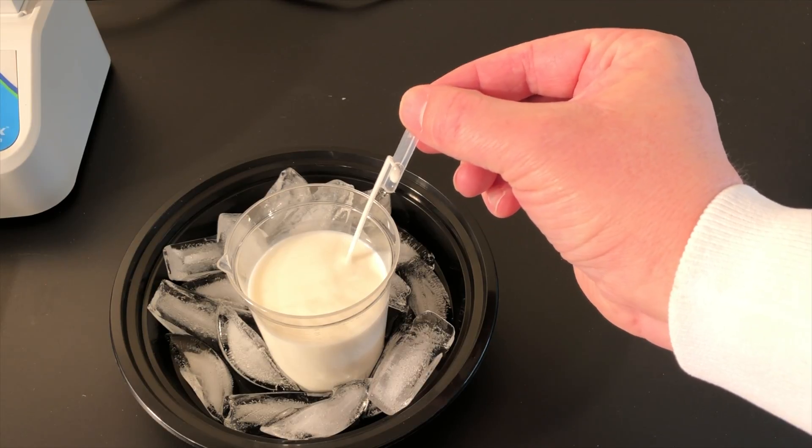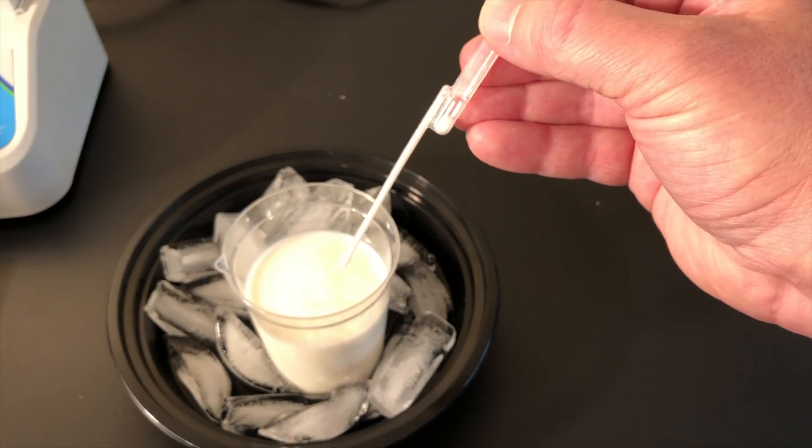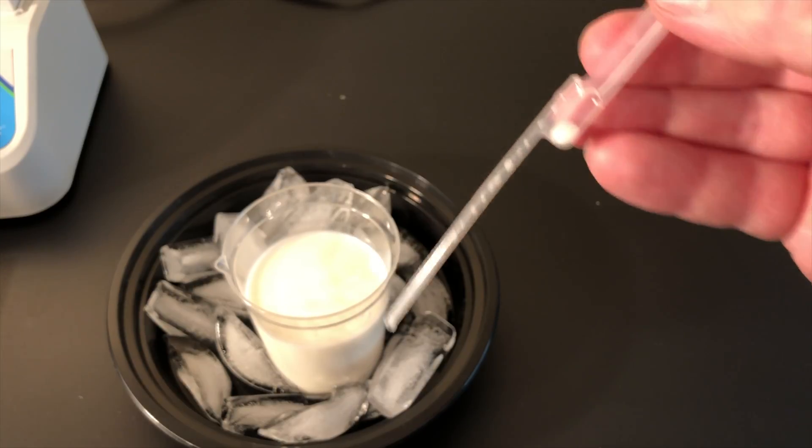Squeeze the upper bulb, insert into the sample, and release the bulb. When you squeeze the bulb to release the measured sample, a small amount of milk will remain in the lower bulb for a perfect measurement every time.